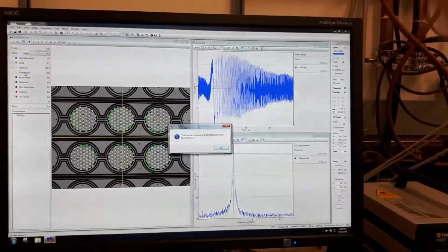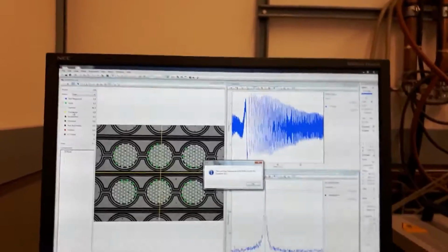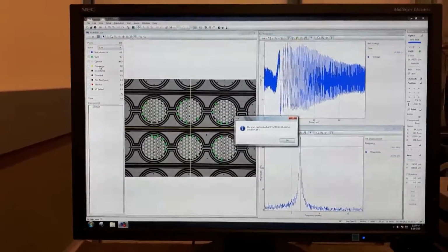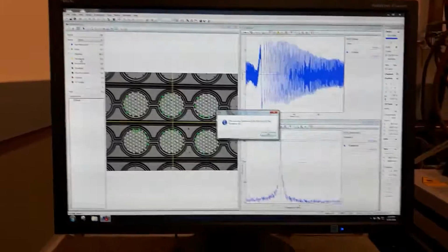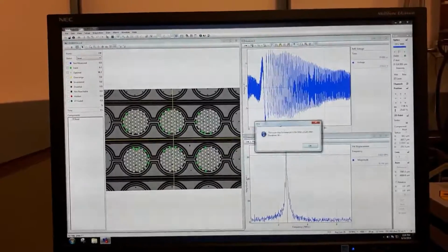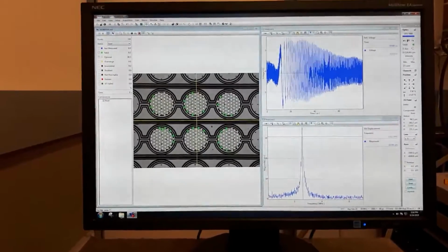So remember to start with something small, from 0 to 200 millivolts, and then 500 millivolts, 1, 5, and then 10 volts, increasing in range. Another way around it is to use a lower voltage for your signals. In our case, the majority of the points were optimal and the rest were valid. So I'll just click OK, and now my file has been saved.